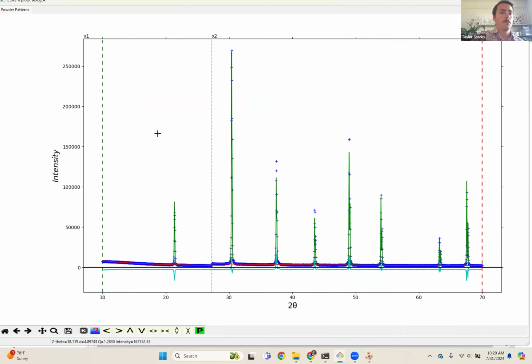Okay, if there's other questions, it's right here. Do you have a recommendation on the amount of RAM likely needed for GSAS? Ooh, that is a good question. And it does depend on a couple things. It depends on how much data you collected and how intense that data is. So for example, synchrotron data takes itty bitty tiny step sizes. So the total number of data points can be massive because it takes tiny step sizes. So those files are significantly bigger than your lab X-ray. Your lab X-ray does not have very many data points. Therefore, the RAM usage, just based off of data points alone, when you're calculating the difference, is going to be less. But there's other things to consider.